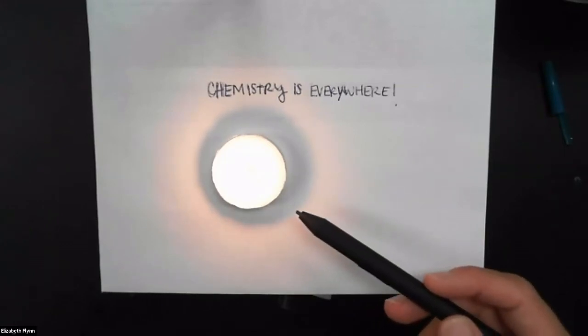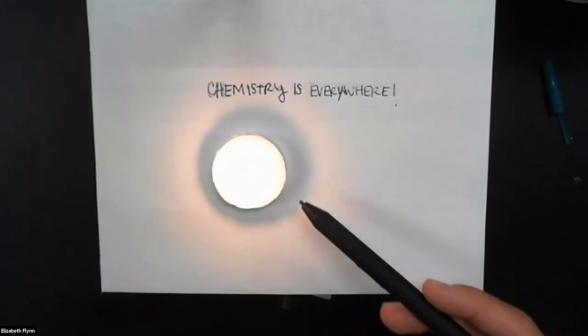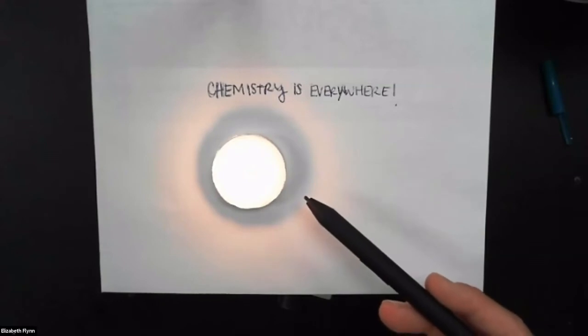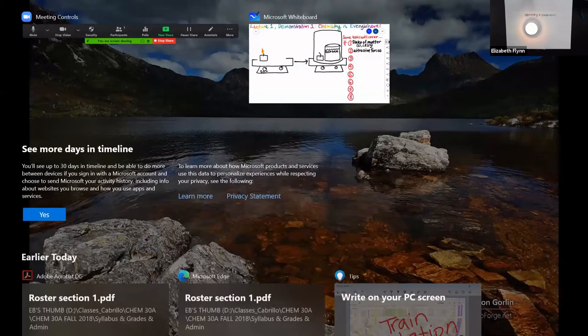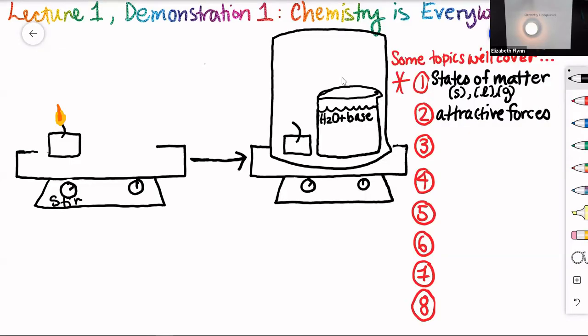Now, once that gas is vaporized, then that is when combustion or burning happens. That is what is sustaining the flame right now, right? So that combustion or that burning, that is a chemical change. That is when something changes in composition. The actual chemical formulas, as we'll see, change for a combustion. And so this is what we're looking at over here, right? We've got a candle burning on a stir plate, and we'll get to what the stir plate is for in a second. And let's write down those other topics we just mentioned. So we said that physical changes occur.